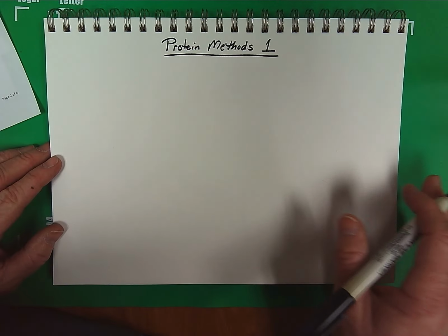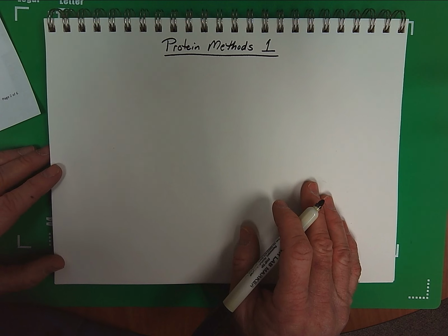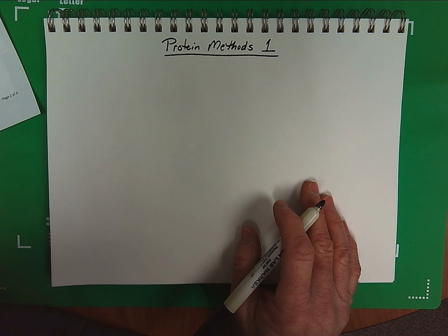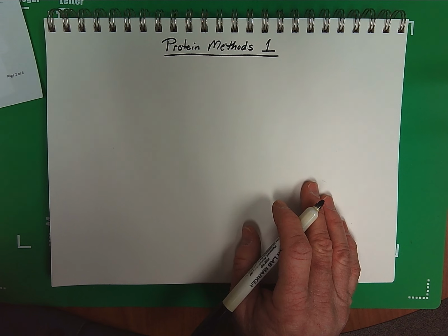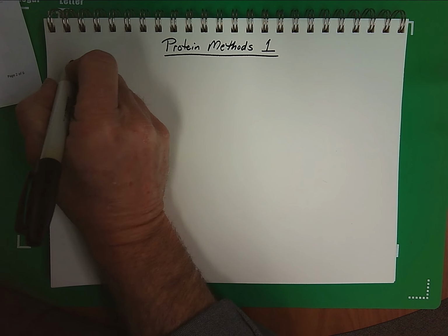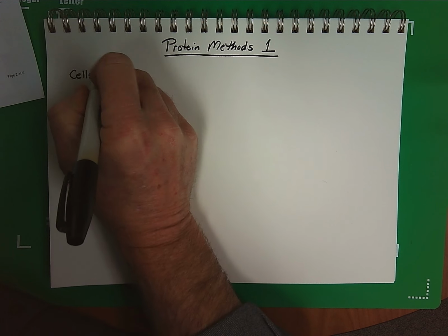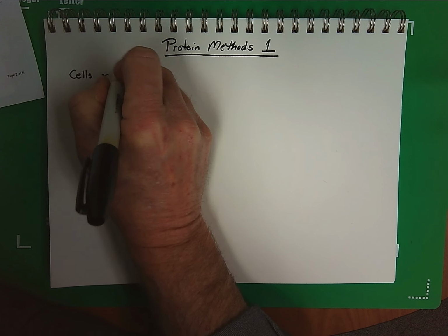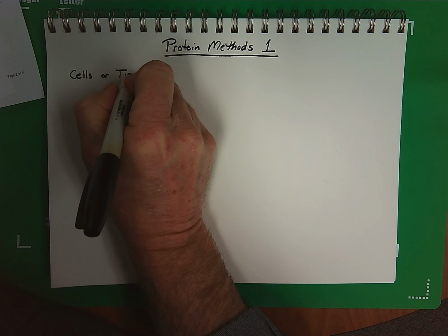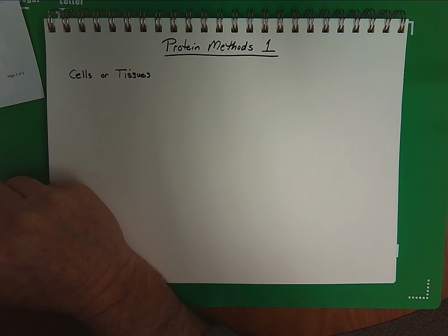And now, for the next couple sessions, we need to discuss protein methods and how we actually isolate these particular enzymes for study. The enzymes need to be isolated in as pure a form as they can be in order to make sure that we are studying exactly the properties that we intend. So the first step of isolating a protein is that we have to identify where the protein is actually expressed. We can either use individual cells that we culture in a laboratory, or we can use tissues that we can harvest from an animal.